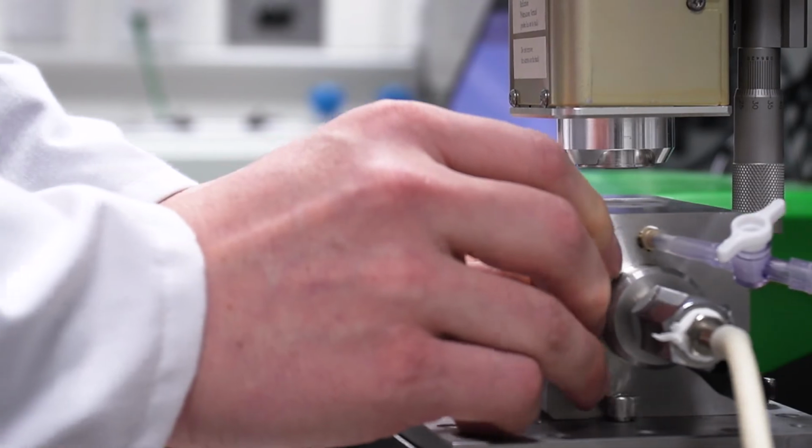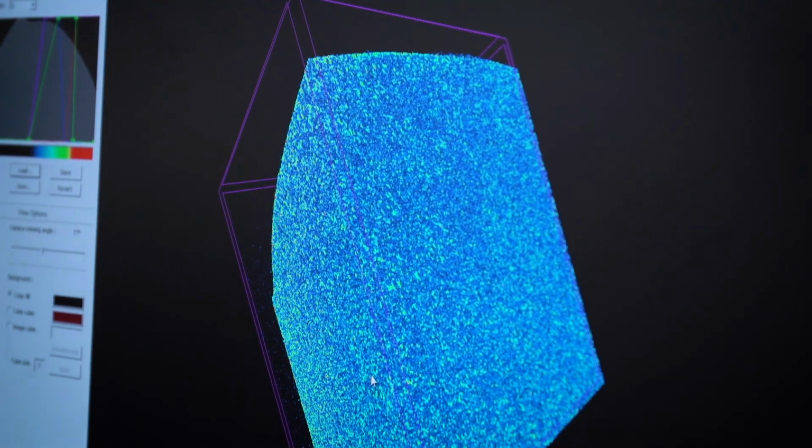One further exciting application of terahertz spectroscopy is to study amorphous materials. Those are materials where there's no long-range order. They can be used in many different industries and have been proven to have very desirable properties. But the one thing that limits their application at the moment is that it's impossible to predict when they will crystallize. Using terahertz spectroscopy, we're able to unravel some of the fundamental dynamics of these materials, which leads to the crystallization. By developing this understanding, we believe that we can really further the application and widespread use of those materials, thus enabling the availability of exciting new materials in the future.